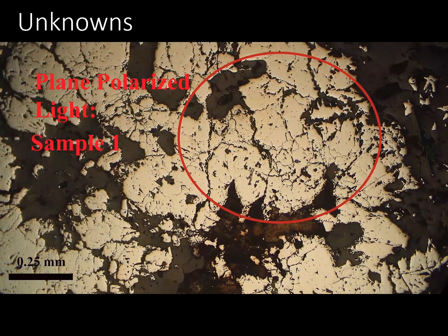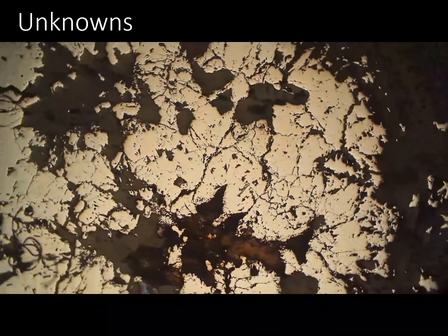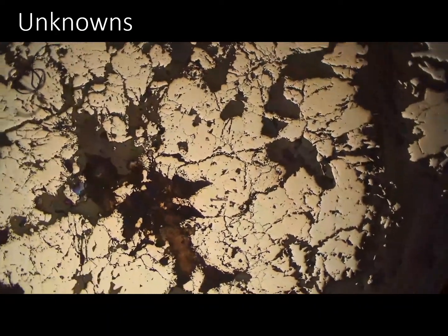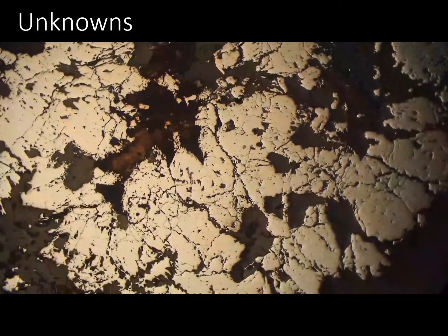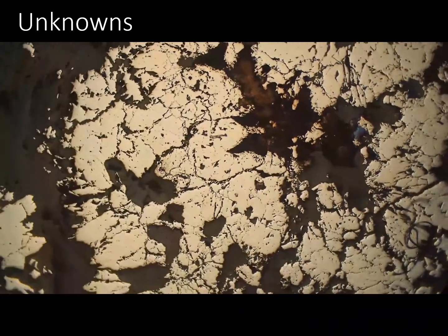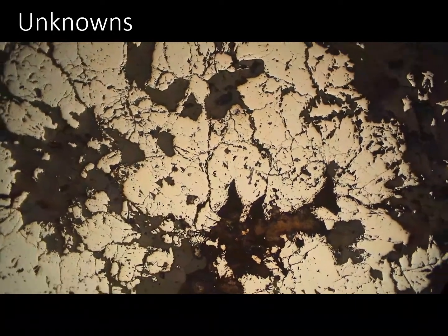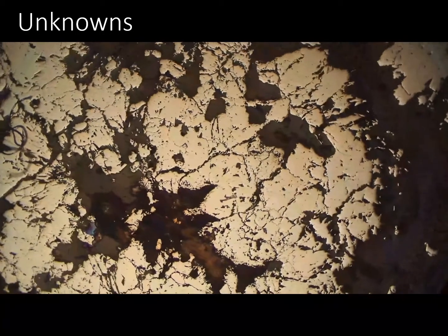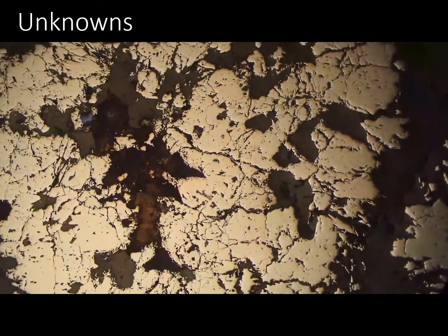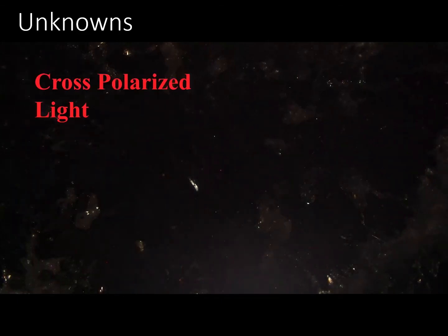All right, so this is sample 1. We're rotating the sample in plain polarized light now. Right now we're switching to cross-polarized light.